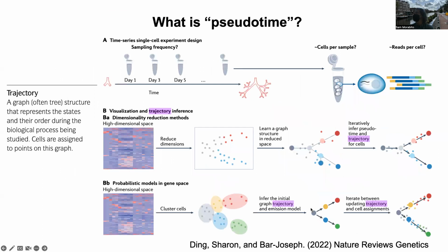is pretty good for understanding different types of trajectory methods. I would definitely recommend this review and the benchmarking paper as background. But there are a couple of tools that only work with time series data. I think in most cases we just have the snapshot data.